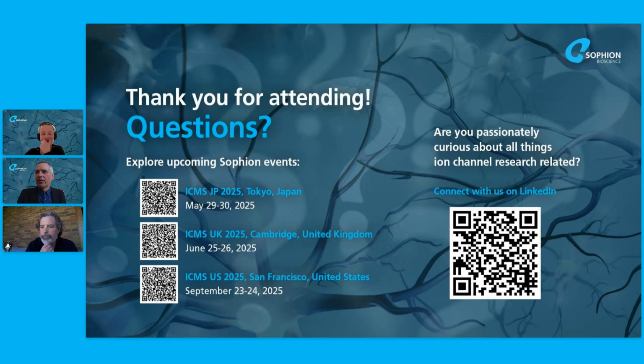So Bob asks, for current clamp recordings, again, this will be more towards Kadla, what percentage of neurons have negative resting membrane potentials? I think the majority have negative resting membrane potentials, but they are quite depolarized in general when we work with dissociated iPSC-derived neurons. I think the excitatory neurons are doing very well on that matter, and their resting potential will be somewhere between minus 70 and up to minus 20 millivolts, something like that.